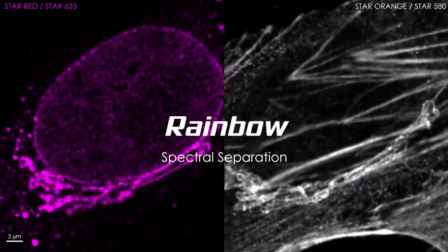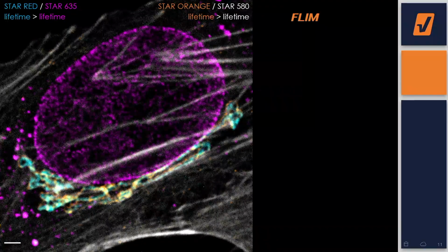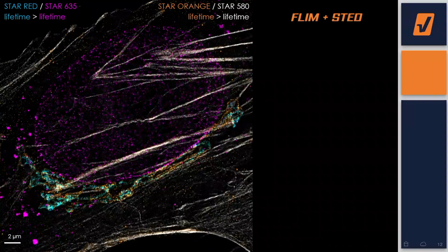But once we add TIMEBOW, we can see there are actually 2 lifetimes hiding in each spectral channel, giving us 4 channels in the end. We can put them together to form one 4-channel confocal image, or when we add STED, we can actually get a 4-channel super-resolved image. In this case, we're just using one STED laser. That's a 775 nanometer STED laser, which means we can record this in one go. And it's very easy to analyze it afterwards.